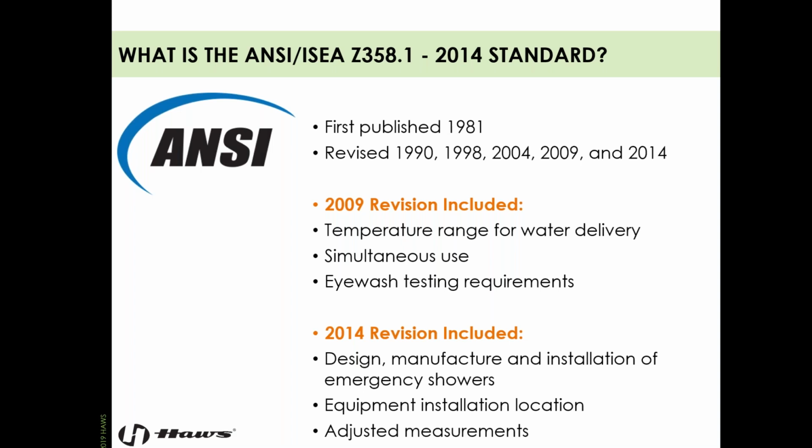And then in 2014, a lot of the changes were geared towards manufacturers of equipment, to make sure that the equipment, including the design, manufacture, and installation, was all pretty much the same across the board. It also included installation location and some adjusted measurements to narrow in a couple of the requirements.